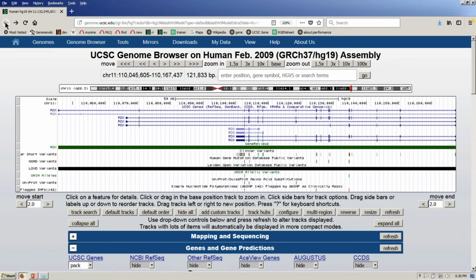So I want to jump now into one of our most interesting and exciting features in the browser, and it's what we call exon only or exon mostly mode. Exon mostly in the sense that you can put a little padding around the exons on the display, and so you can see a little bit of the adjacent intron if you're interested. If you do whole exome sequencing, your exon capture array will often capture some fragments of DNA that extend into the intron, and you may be interested in seeing your coverage over there as well in the intron. So you may want to pad your exons a little bit in the display.